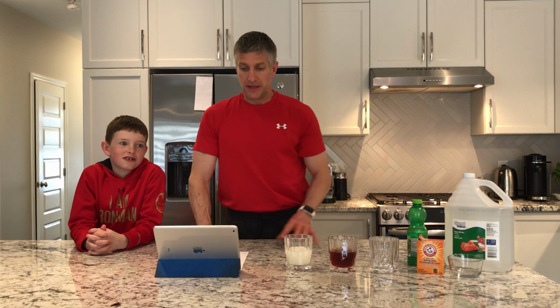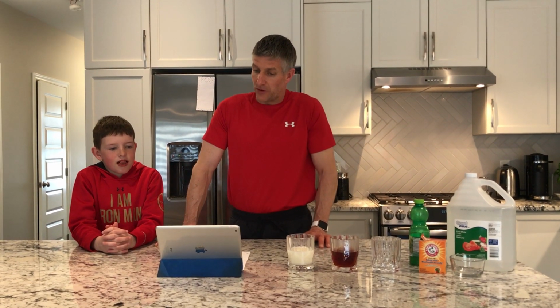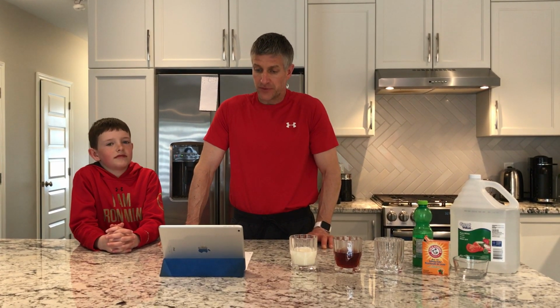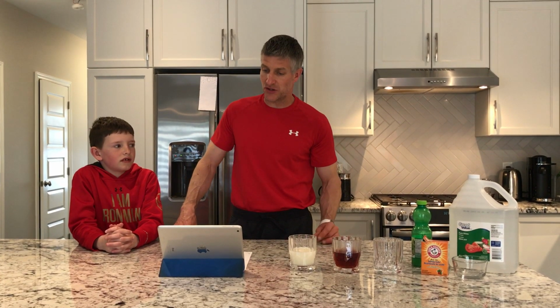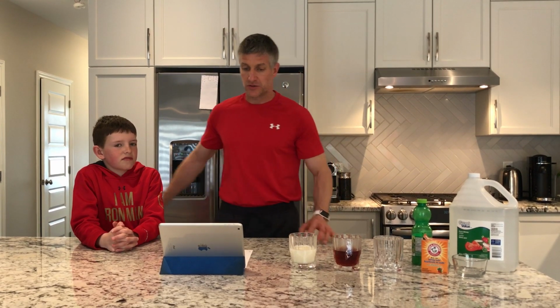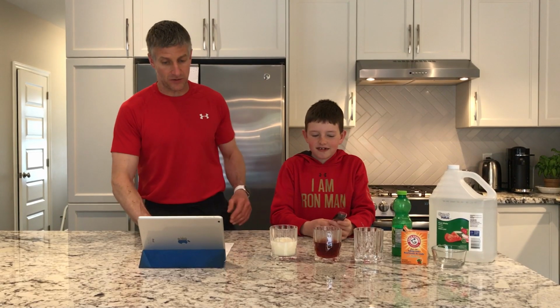There we go. So a little introduction for you. Chemical changes occur everywhere and all the time, at home, at school, in our own bodies as well. In this activity, you will identify any evidence that a substance has changed its composition and something new has been produced. So the equipment that we're using today, Duncan's going to point to it.